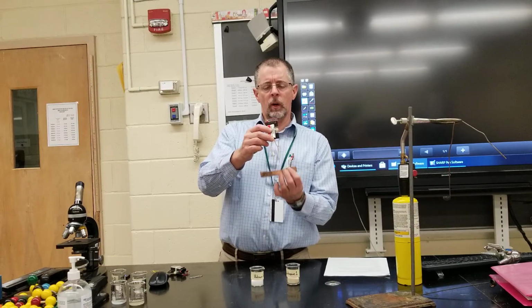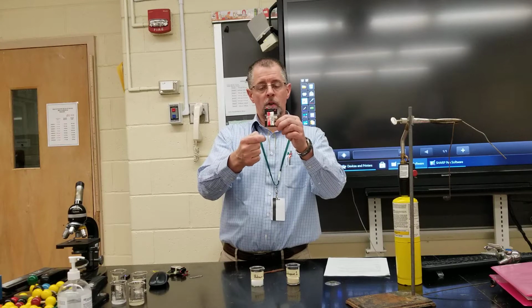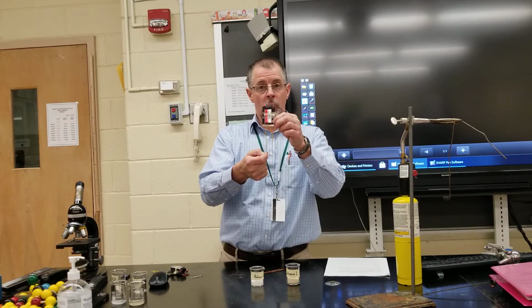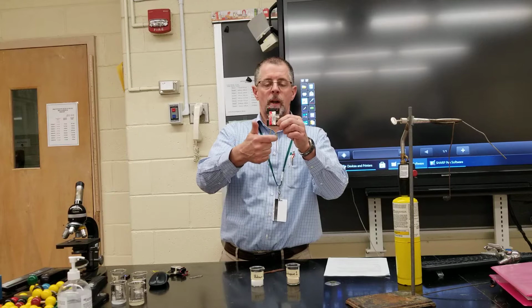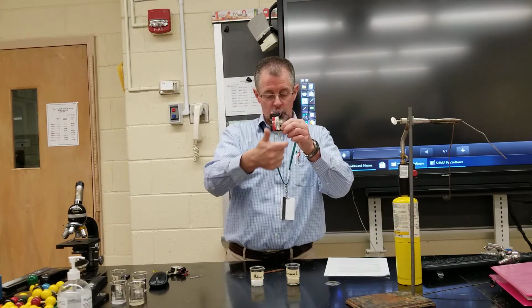Now, how does this work? The electrical charge is being carried down the wire by mobile electrons. Those mobile electrons pass the charge onto the mobile electrons of the metal, which carries the charge to this electrode and transfers them to these mobile electrons, which now carries it up the wire on this side. So you wind up with an electrical circuit.